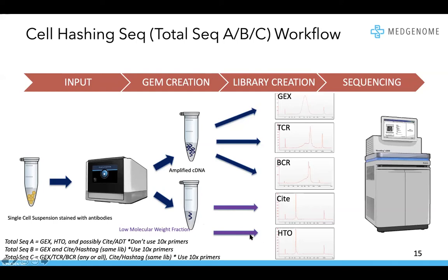libraries being amplified here. And then again, based on the workflow you have, you can still have your gene expression, TCR, BCR libraries. So it does get complicated at the bottom. This is just for reference later on.